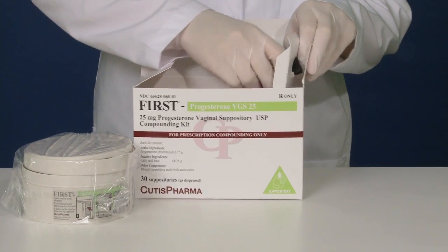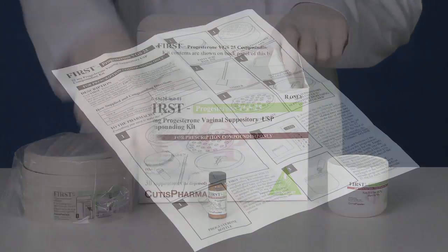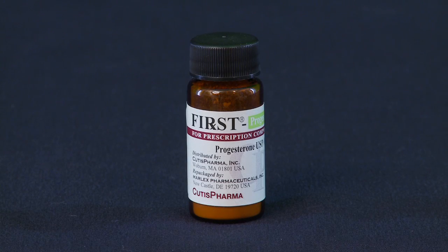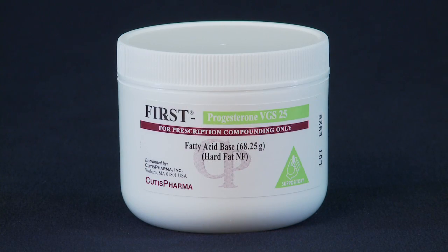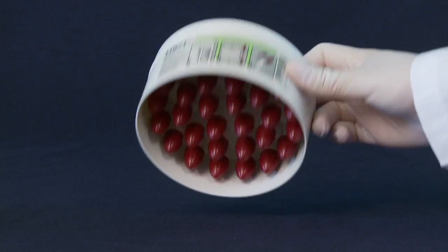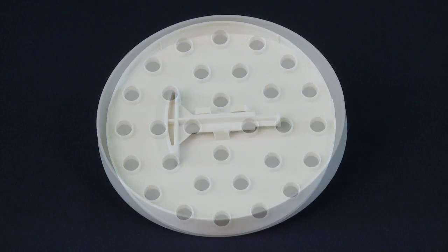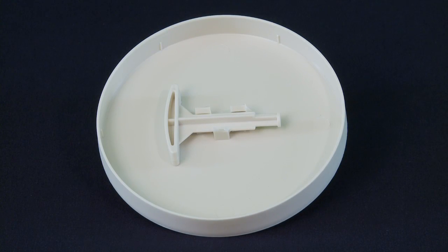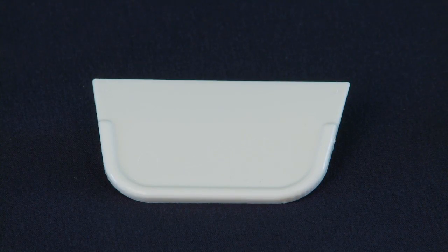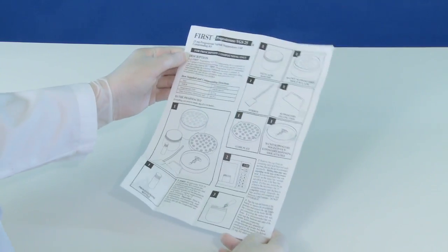Begin by opening the box and verifying that all of the components are present. You should have the following: the package insert, a vial of pre-weighed micronized progesterone powder, a jar of pre-weighed fatty acid base, a 30-unit suppository mold with caps, a suppository mold guide plate, a mold cover with a suppository dispensing tool, a stirrer, and a filling tool. Take a moment to review the package insert to familiarize yourself with the procedure.